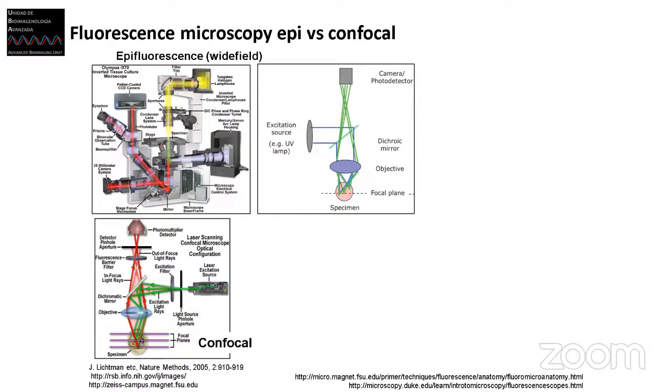So we focus the light before the detection, and we make the light pass through this little hole, and all the light that is not right in the focus of this hole will be rejected. And this is the reason why we can cross-section a slice of our sample with the confocal microscope.